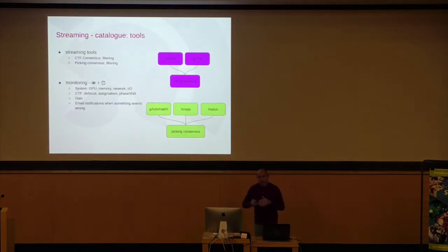So since Scipion integrates different software, now you have the chance to play around or have options to work with your data. For example, we have 2 consensus methods, CTF consensus and picking consensus. What they do is, you can estimate the CTF with 2 different methods, and then you can join the output in a CTF consensus.